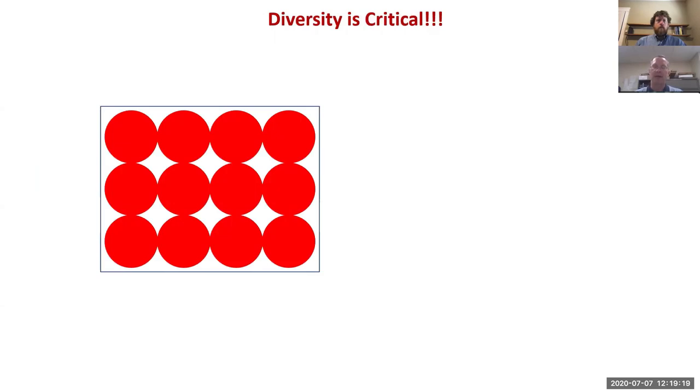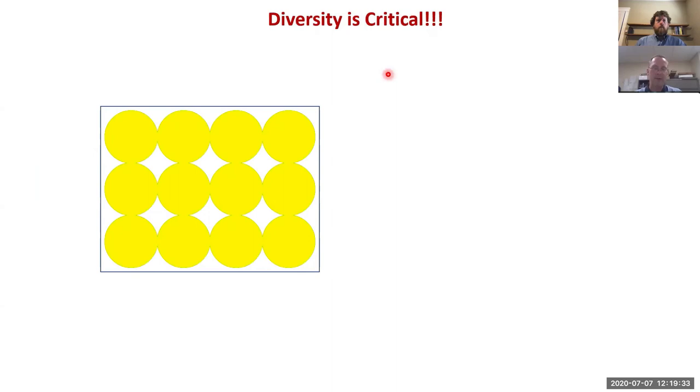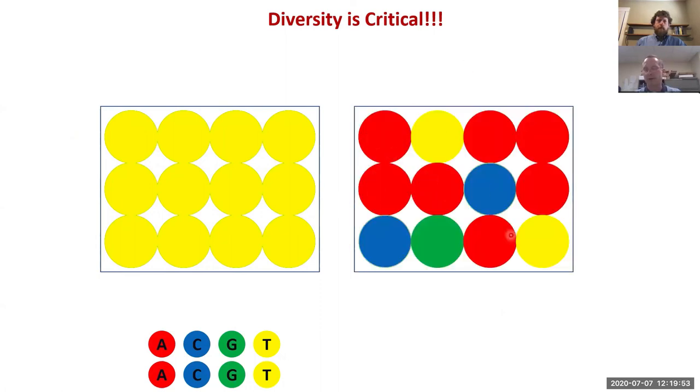Another important thing is that diversity of the library is critical. If your library is all the same then in the first cycle everything is, let's say A, and then everything is G, T and C and you end up with the sequence. That is actually a problem because the software uses the first two cycles to establish the matrix where the different clusters are, and if they're all the same then the software doesn't know where a cluster starts and where it ends.